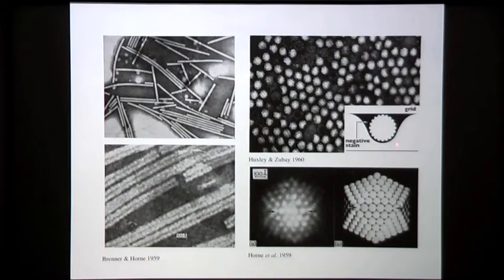And what happens is that the stain, the black here, dries around the biological particle on the grid and nicely outlines the surface of the particle, so that what you see, as it were, is a hole in the stain when you look at a negatively stained particle. And this is why it's called negative staining. This was a term invented by Sidney Brenner when he was still doing microscopy many, many years ago.